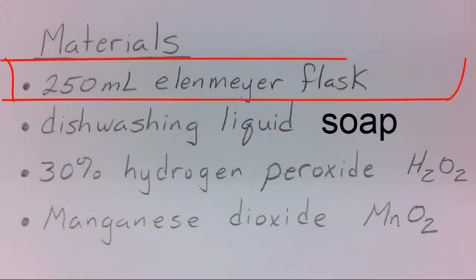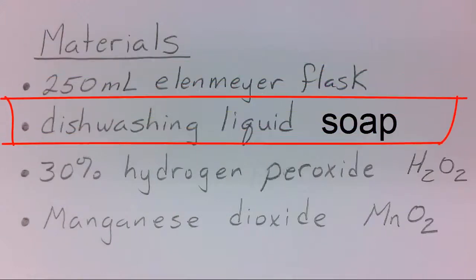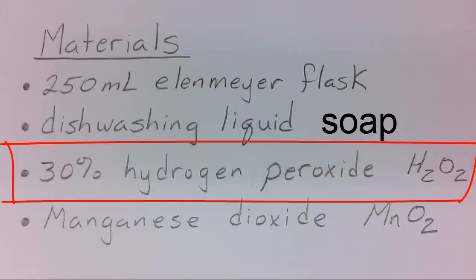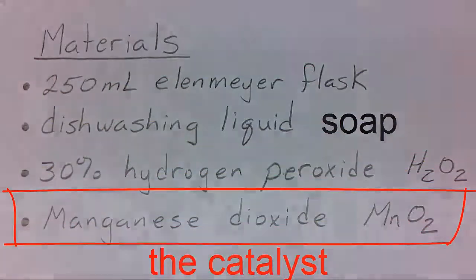The materials used are an Erlenmeyer flask, dishwashing soap, 30% hydrogen peroxide, and the catalyst manganese dioxide.